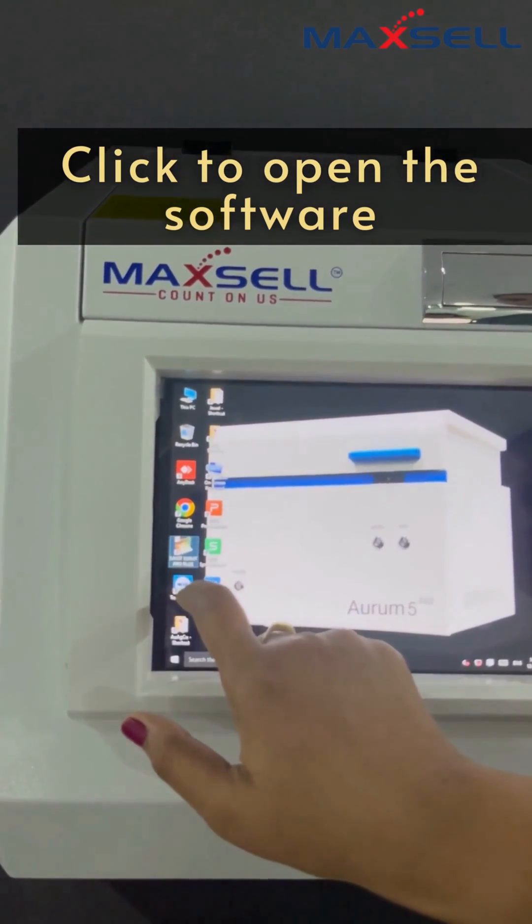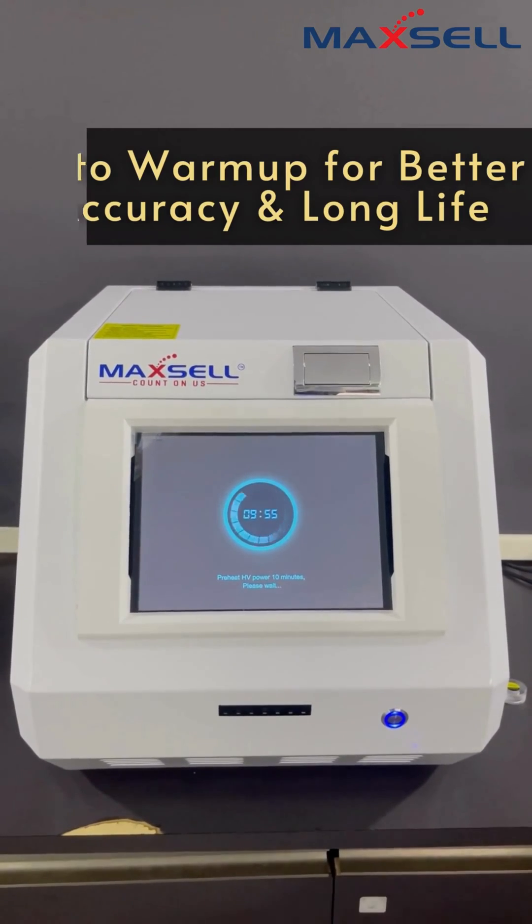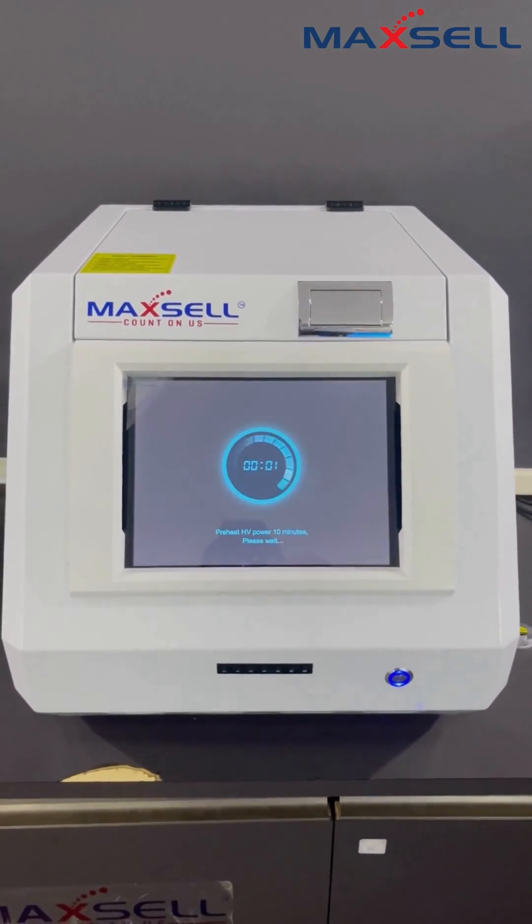Open the testing software and warm up for 10 minutes. It improves accuracy and longer life of the instrument.